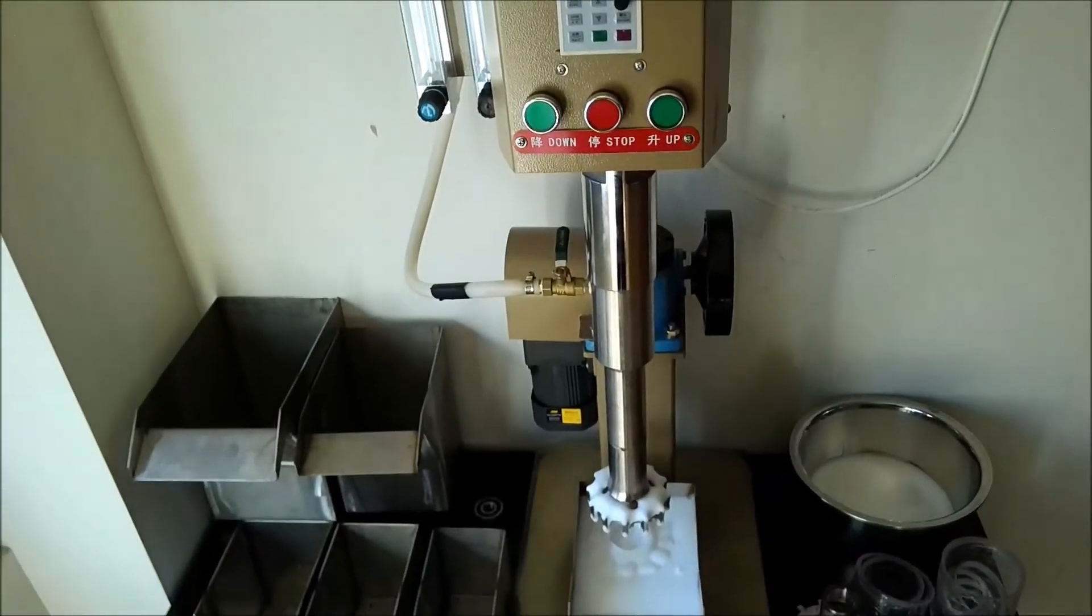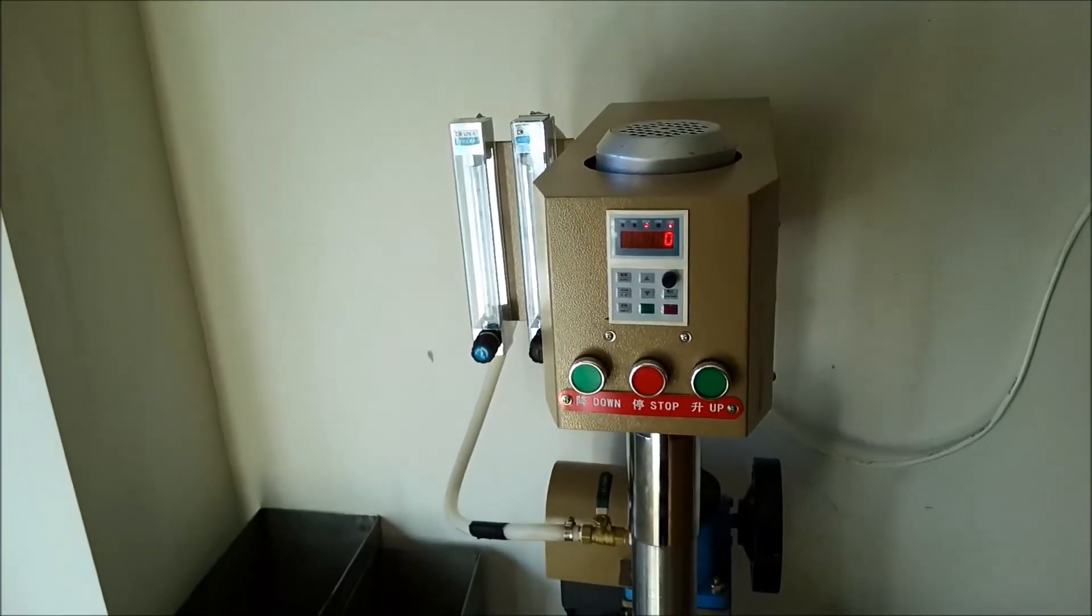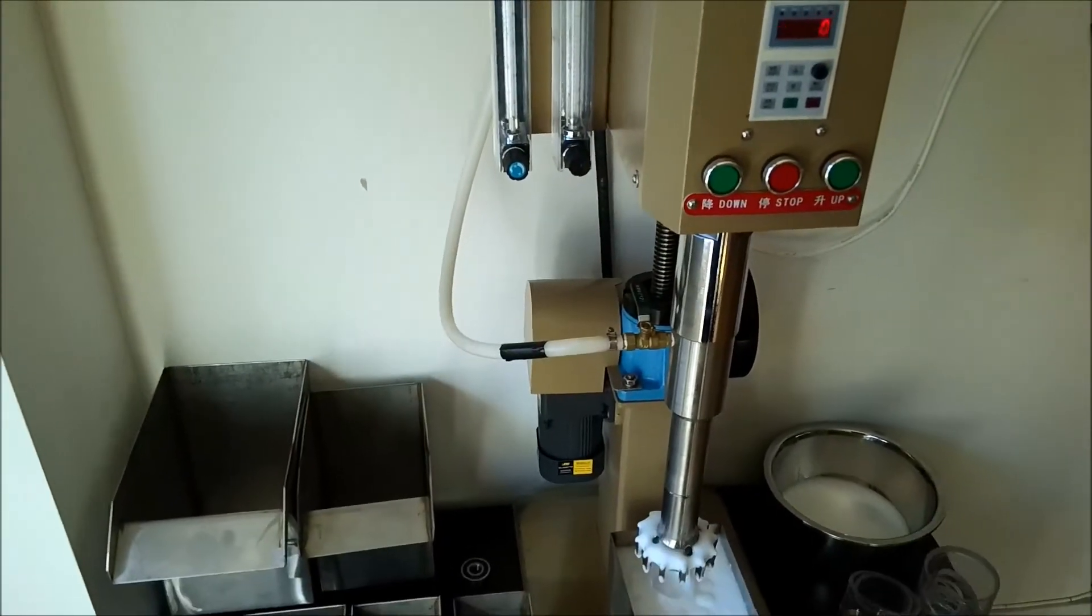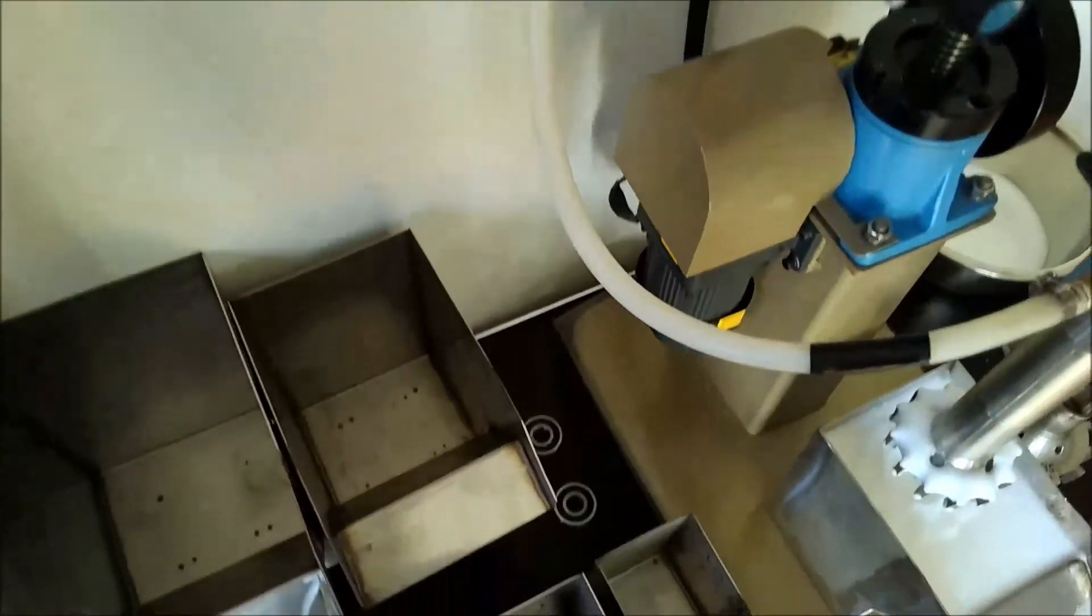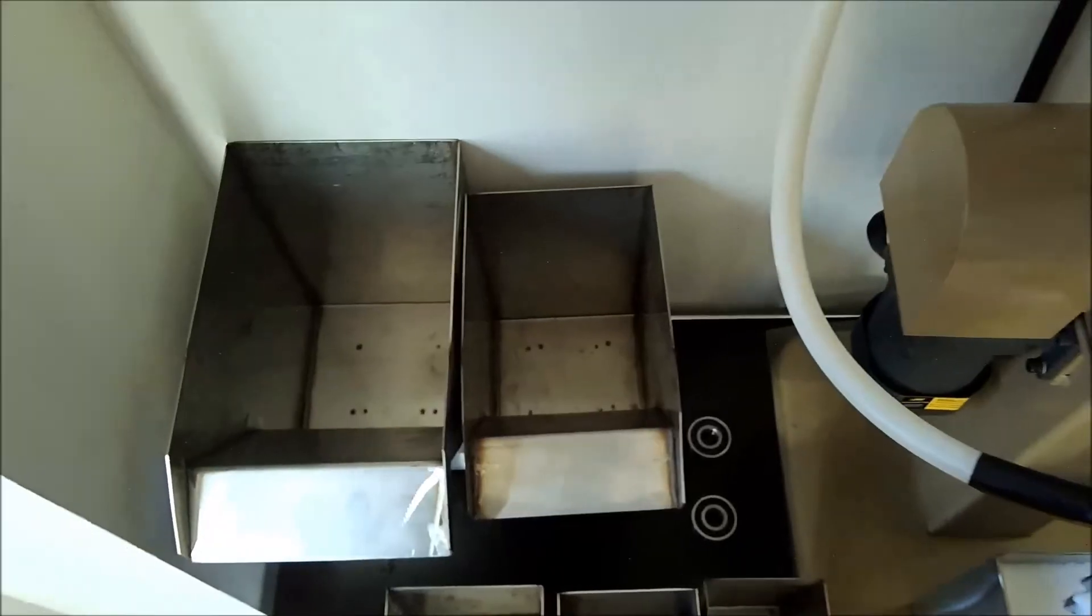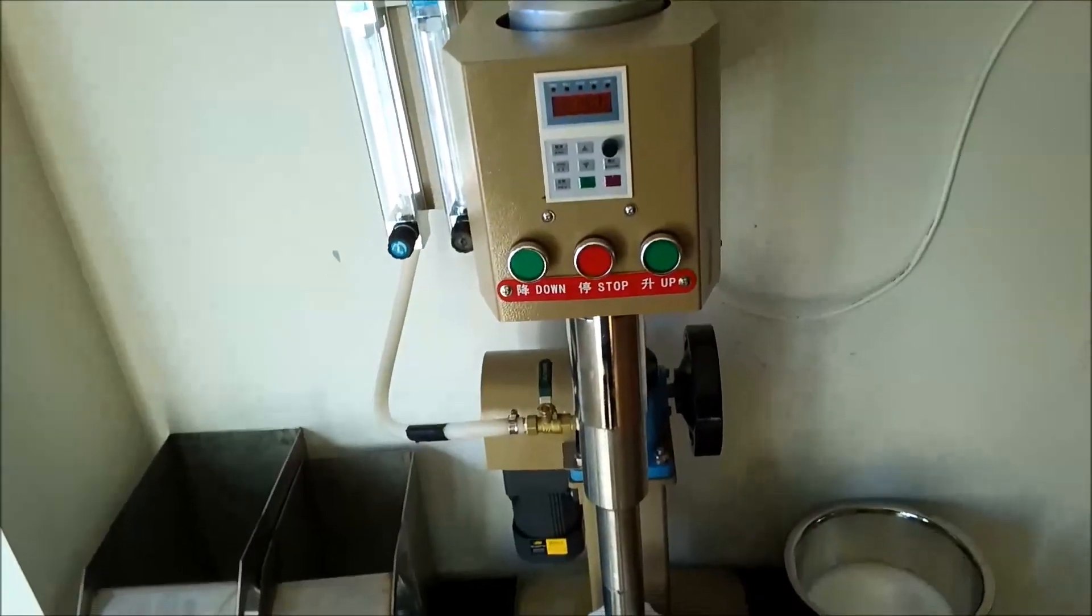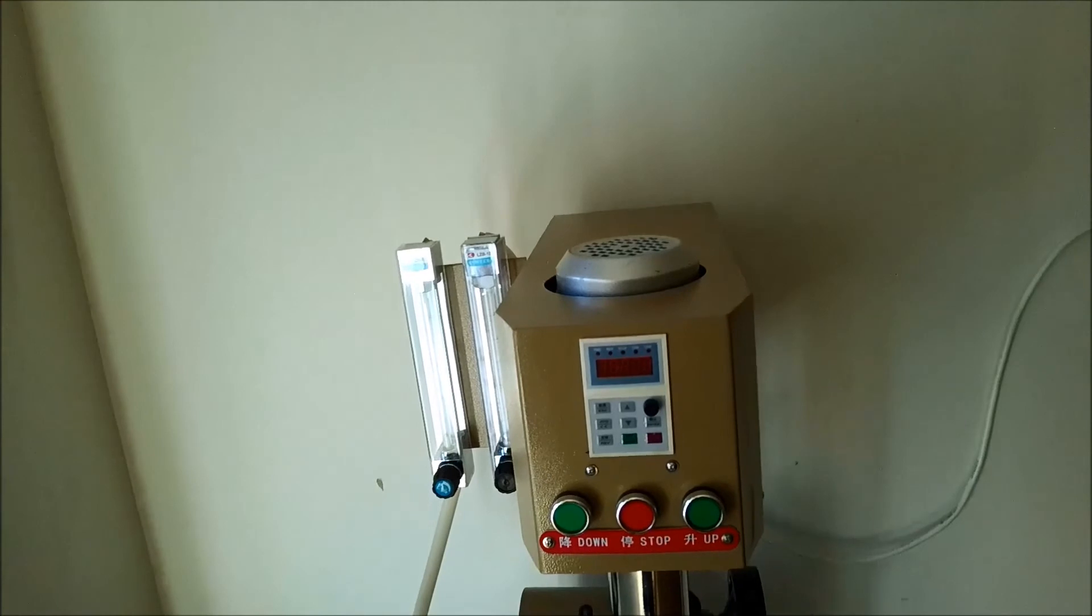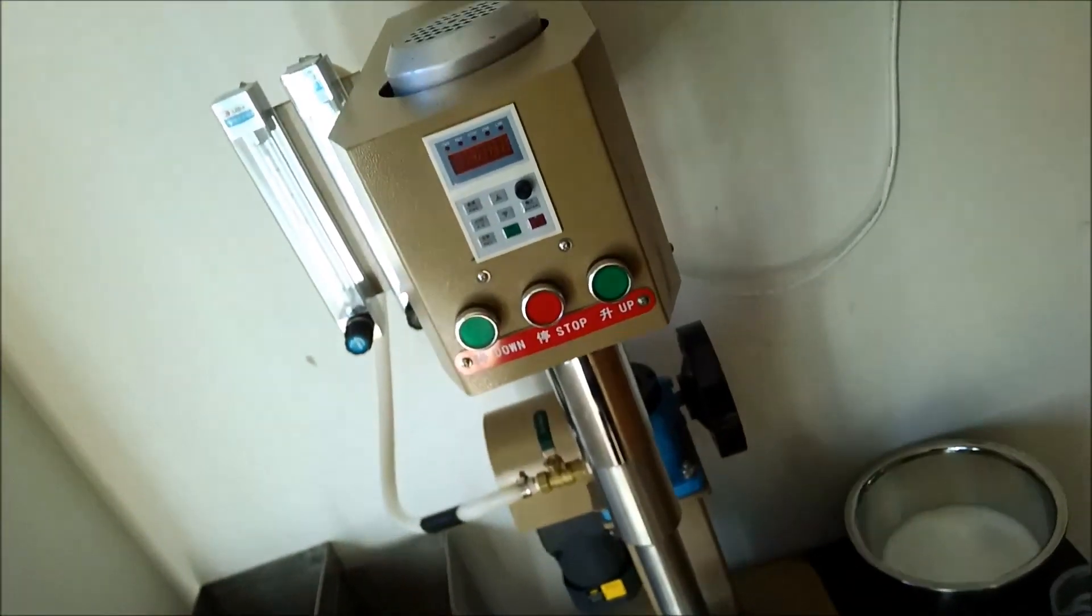So there you go. Very nice machine. The tanks are thicker than the original D12. The gauge is like, it's a millimeter and a half. Pretty thick gauge, that's for sure. All right, buy one today at 9-1-1-Metallurgist. All right, here we go.